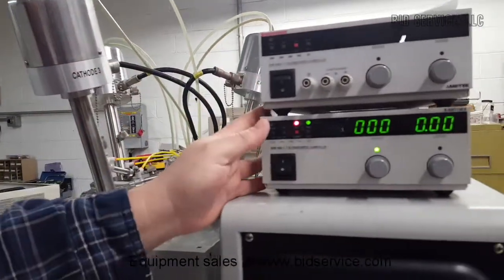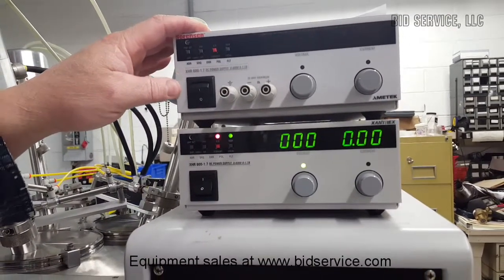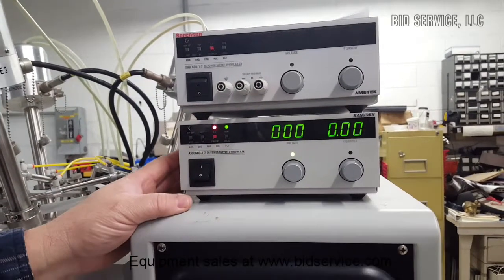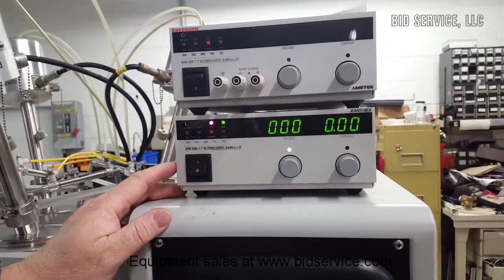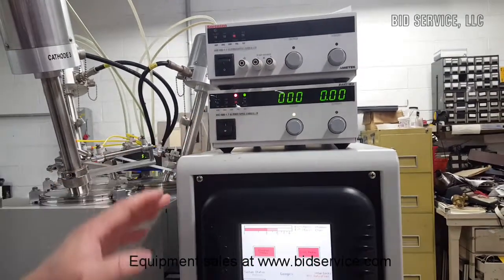Over here you've got two power supplies. The top power supply is a manual power supply that came with the system — just in case if you ever wanted to do something further with this. The one on the bottom is used to control the system. It's all run integrated with the system and will turn on remotely with the controller.